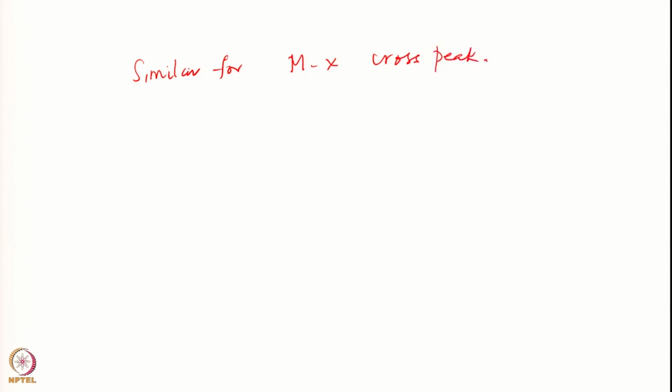okay. And what about this peak? Let us look at the peak where this side is M, this side is A, and what will that be? Okay, here we have a doublet, and here we will have plus plus minus minus. This will produce plus minus plus minus minus plus minus plus. So you see the symmetry is broken, the peaks do not look identical.